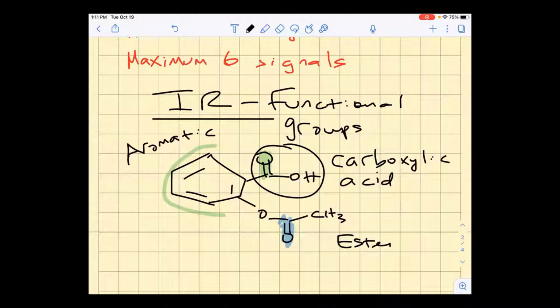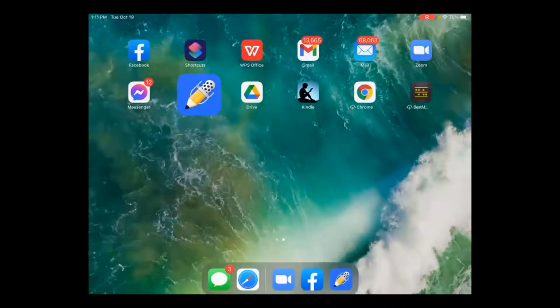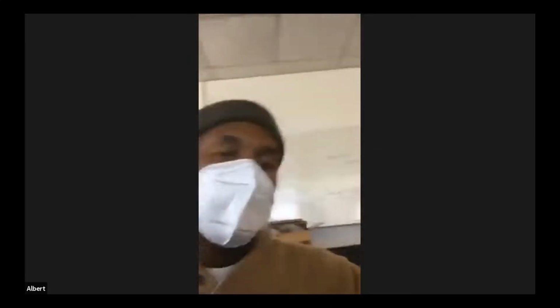All right. So let me stop sharing, and then we're going to prepare our samples, and we're going to go downstairs to the NMR. There's going to be a little bit of a lag between when we set the samples up and when we actually get downstairs to run them. And then we'll come back upstairs to do infrared, the FTIR. I can actually show you that while we're up here. Just turn the camera around.